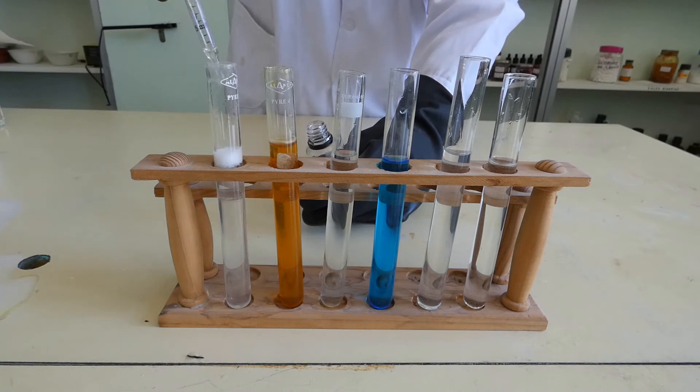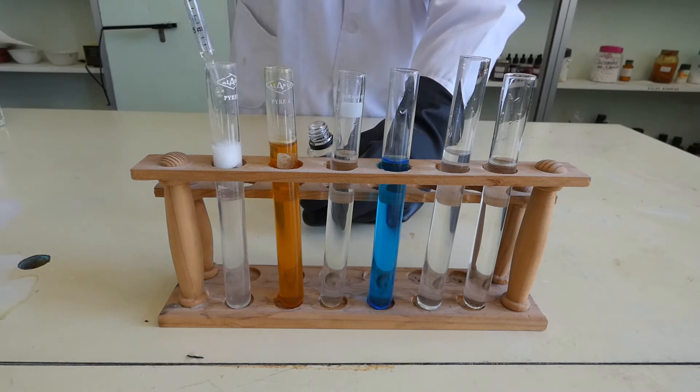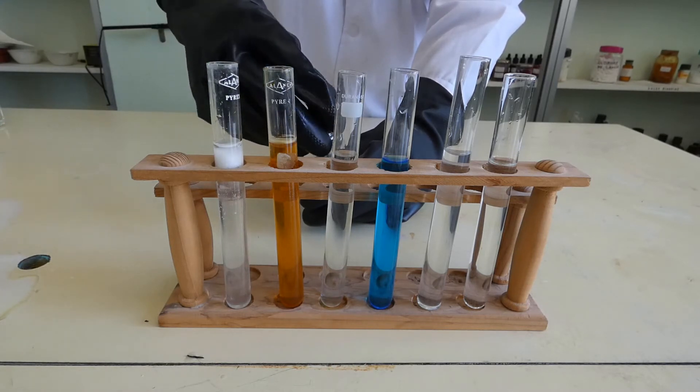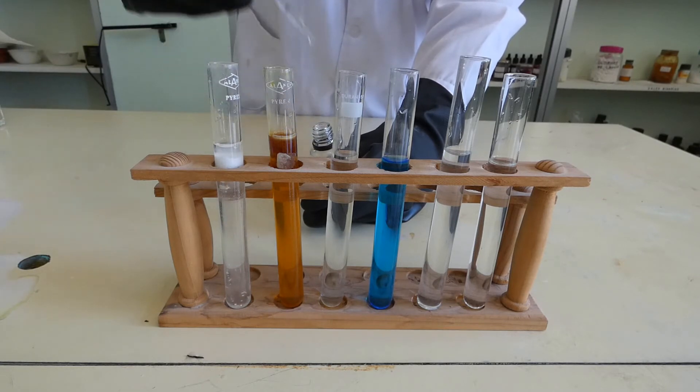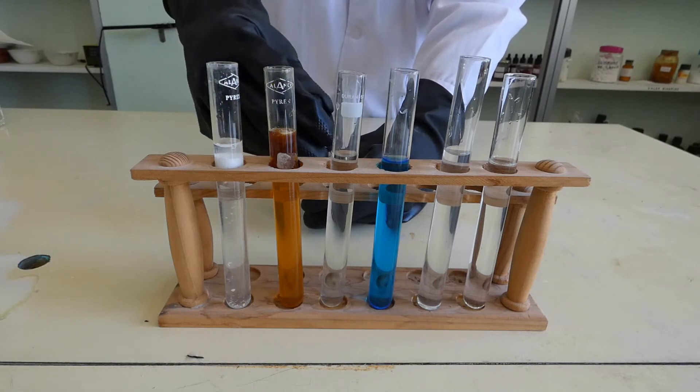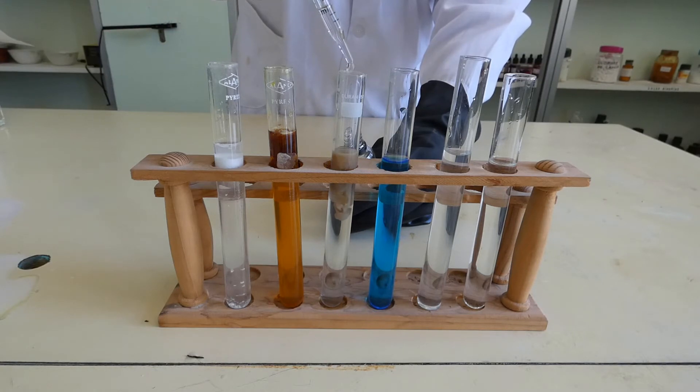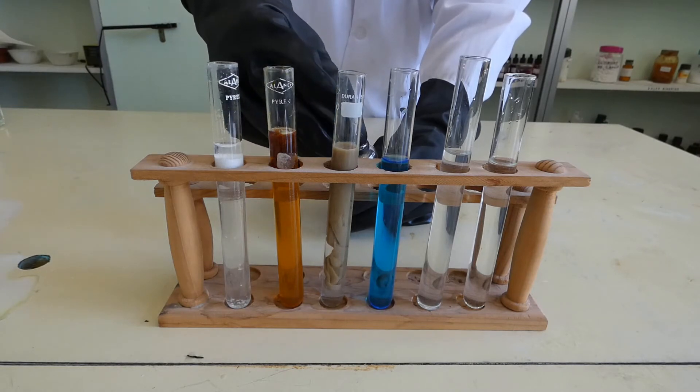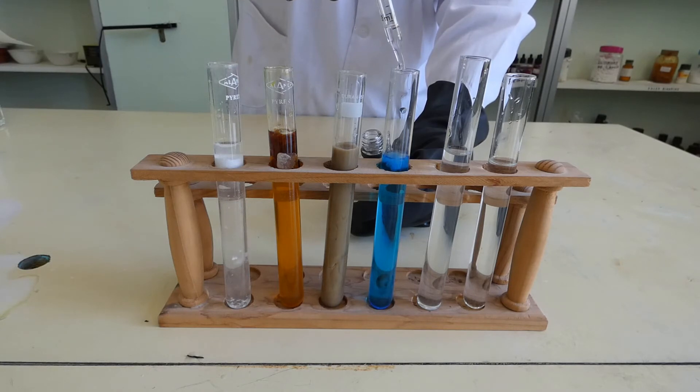Lead-2-hydroxide is formed in the first tube. In the second one, iron-3-hydroxide. In the third one, silver-hydroxide. In the fourth one, copper-2-hydroxide.